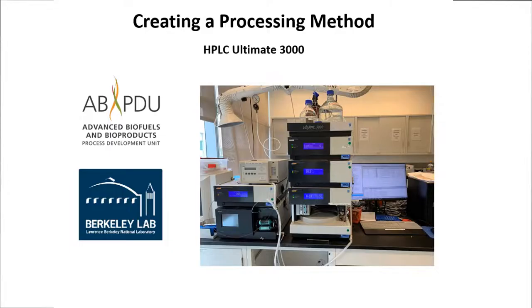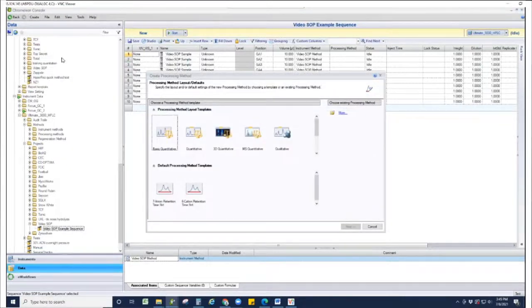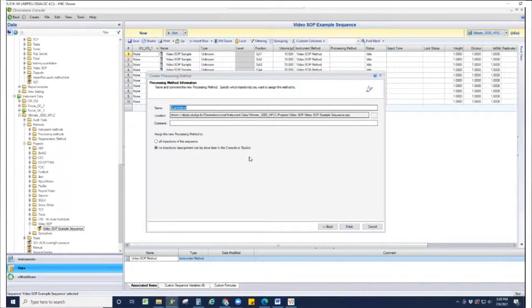If you do not have a known processing method, you will have to create one. You can do this by navigating to the Create tab and selecting Processing Method. Select one of the processing method layout templates, such as quantitative or basic quantitative, and select Next. Name your method and select where it will be saved and to which injections this method will be applied. Click Finish.